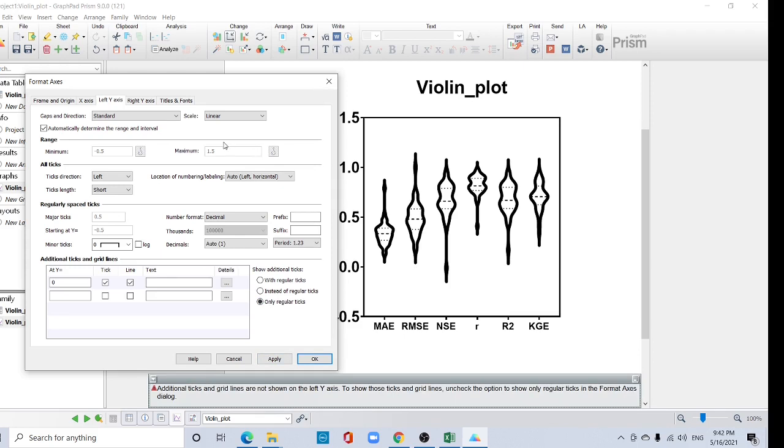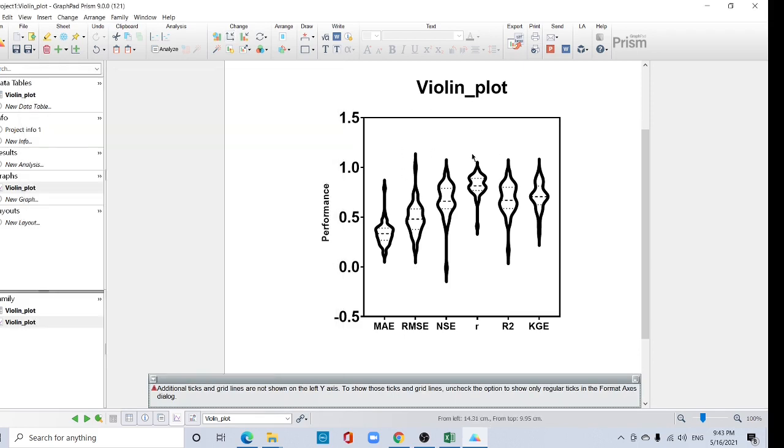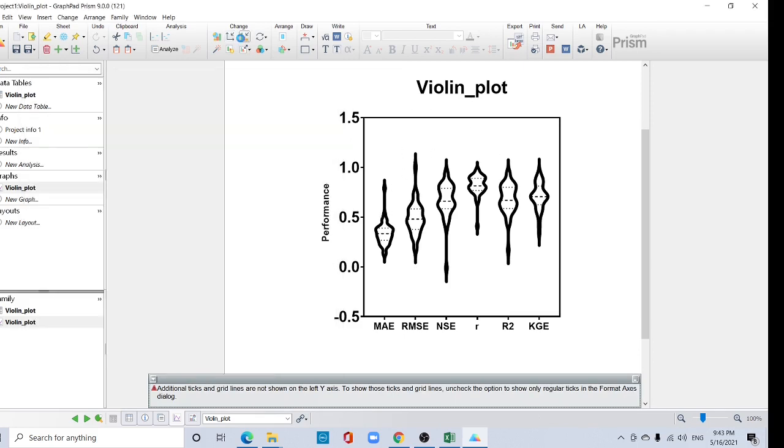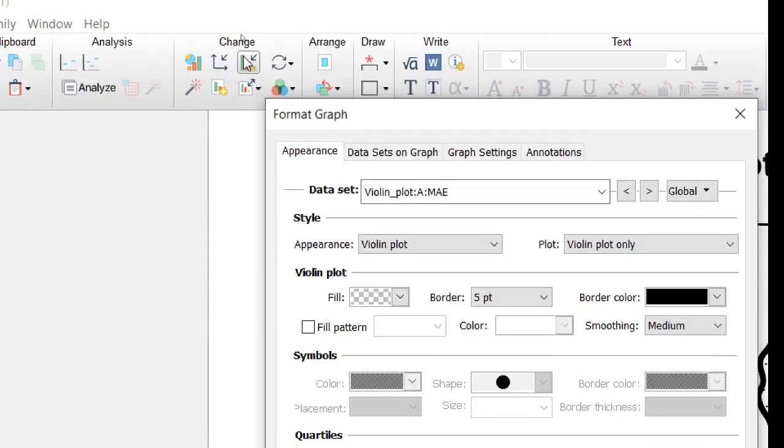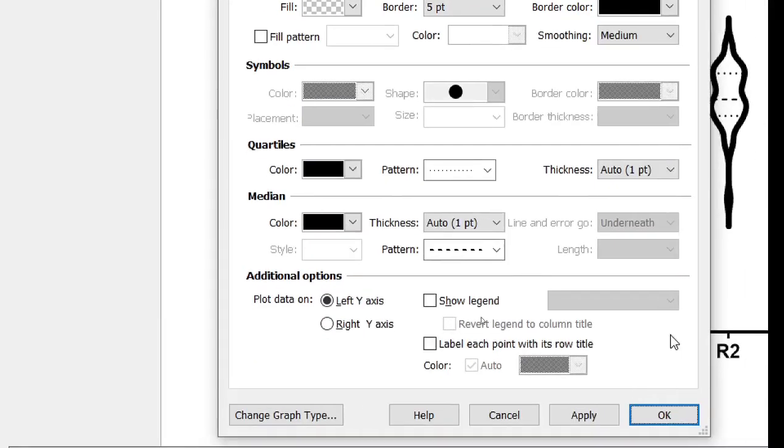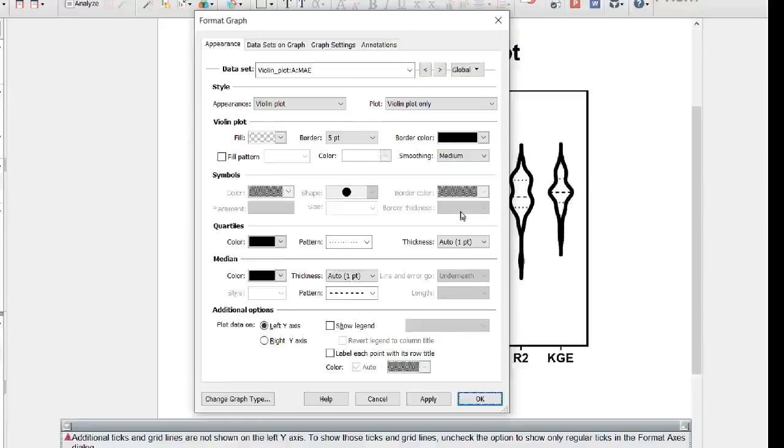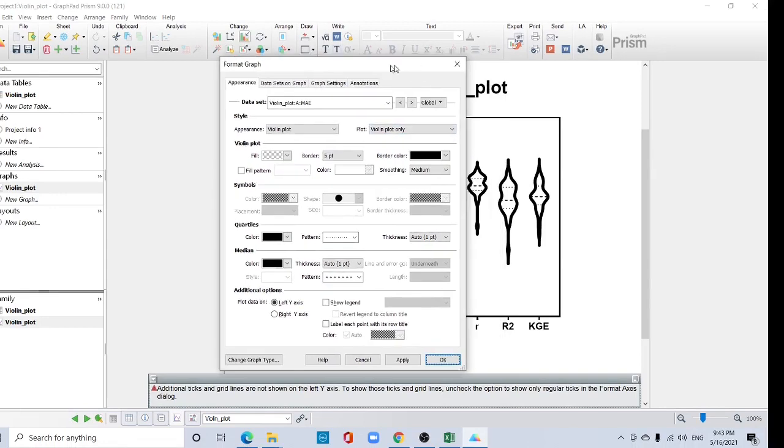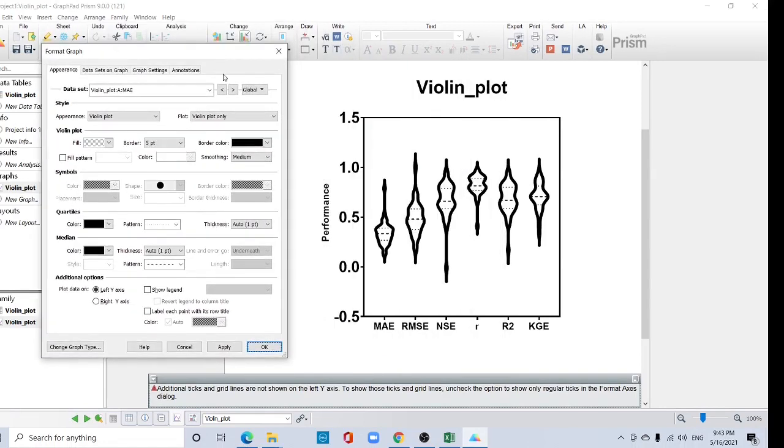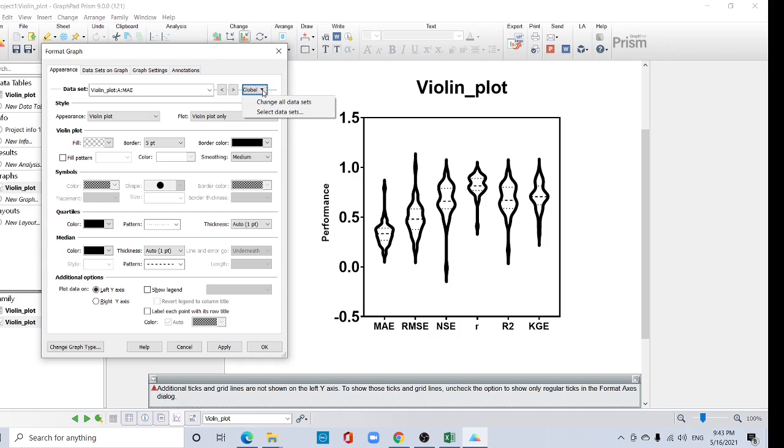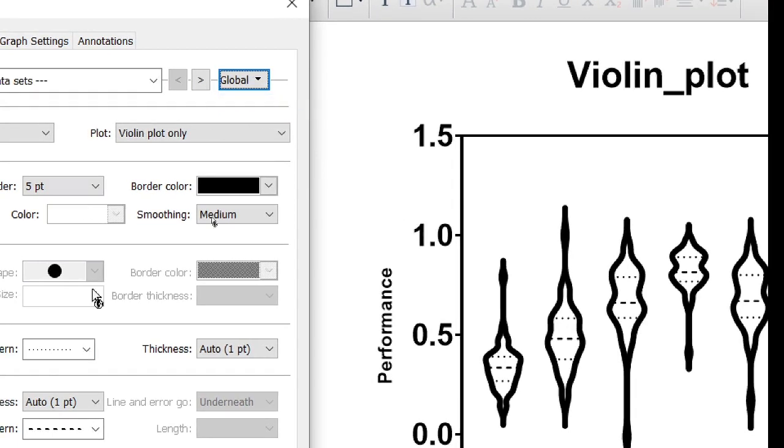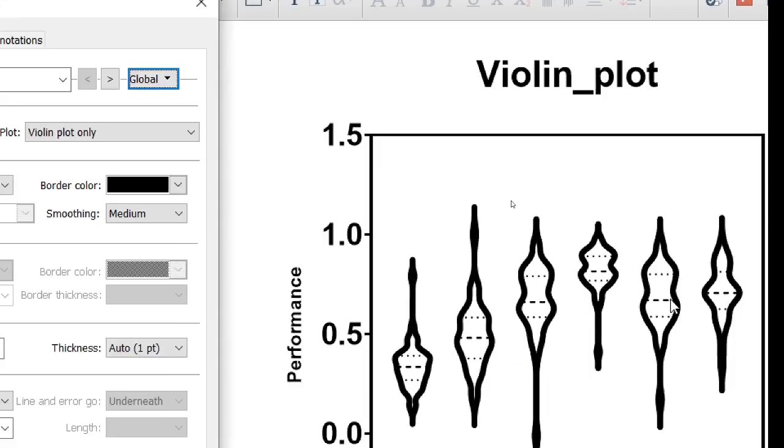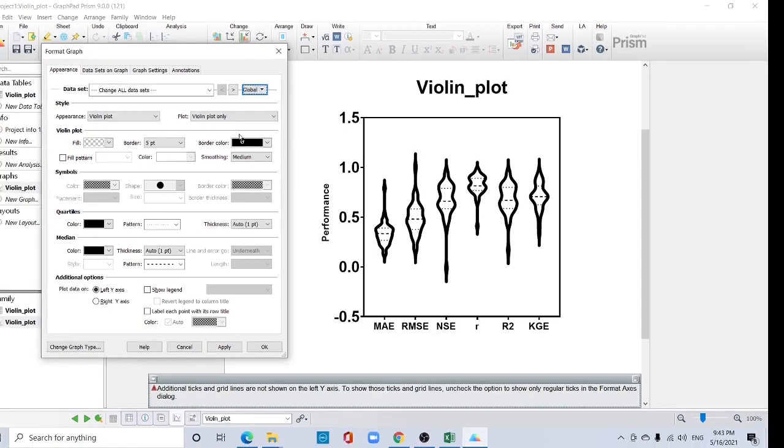Okay, now I want to format more. Click this format graph. This option and it will be open like this. Here you have to understand one thing, this setting. There is a change all setting, that's in global. Okay, in the global setting if you select change all data set, that means all data set will be changed. So global, I want to change border thickness into three.